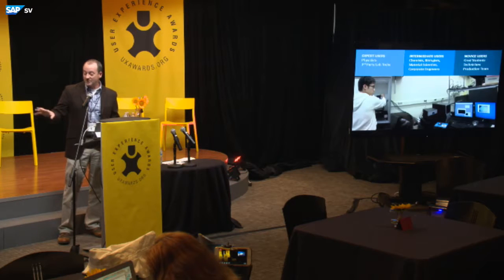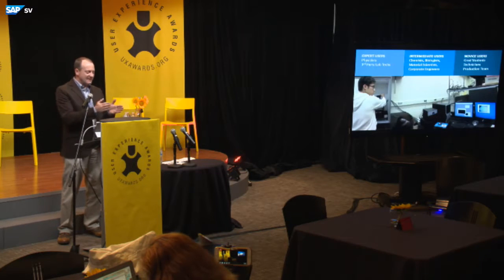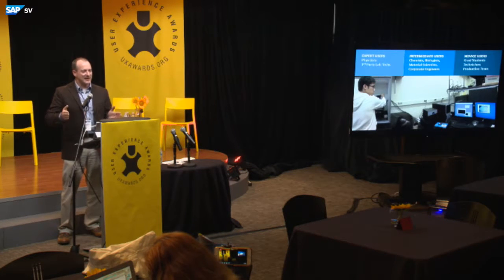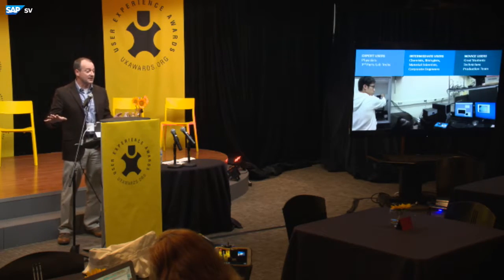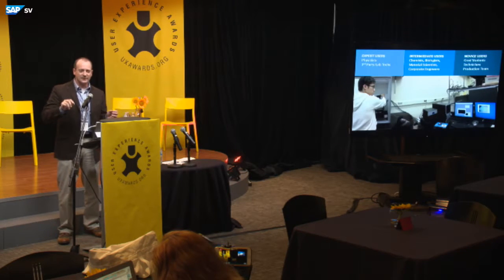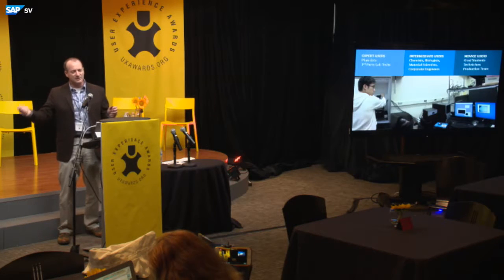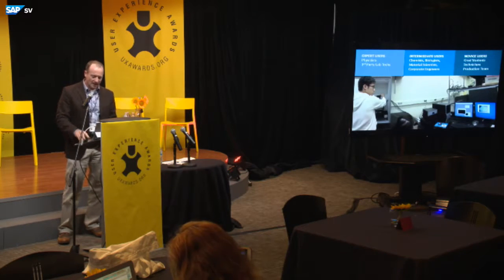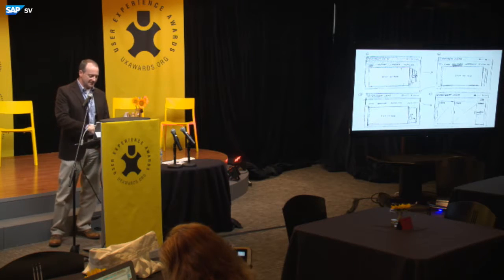Not surprisingly, one of the things we found out was that new novice users tend to need most of the help following a very linear, basic path through the application in order to take a decent picture of something really small. Experts, on the other hand, tend to jump around. They work non-linearly. You know, they'll do something here, they'll go back a couple of steps, make a change to a parameter, jump forward 3. In order to accommodate that, we did a number of things.